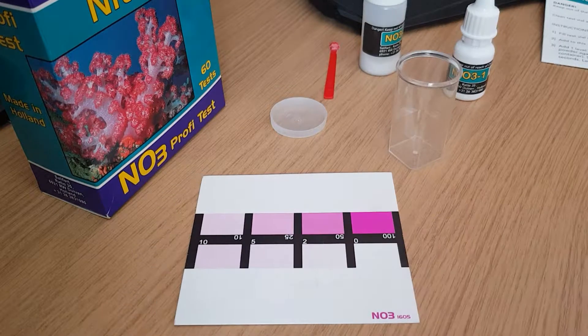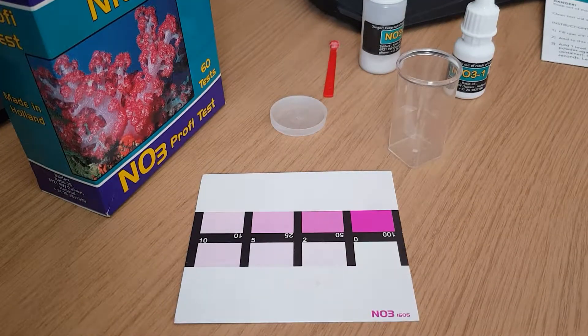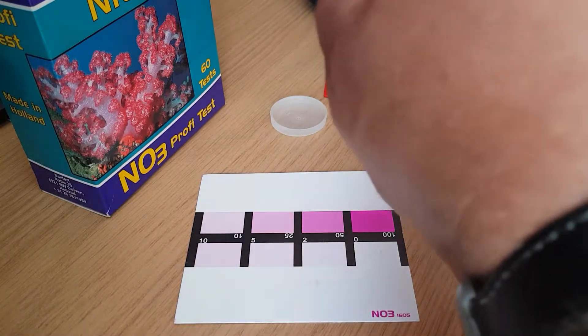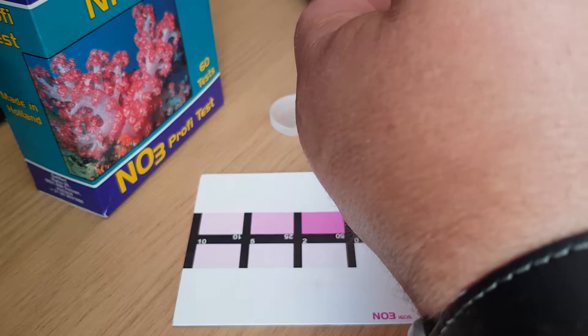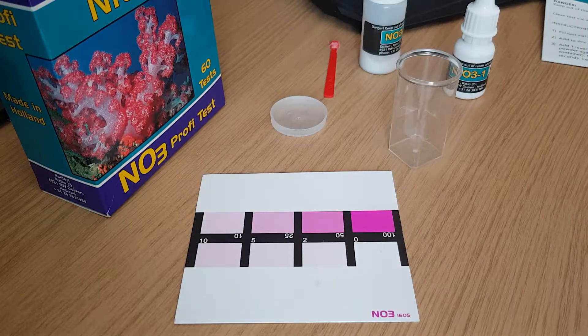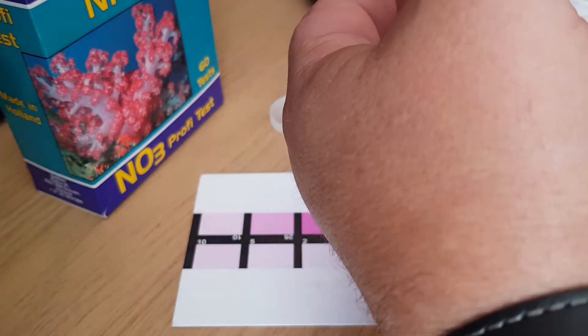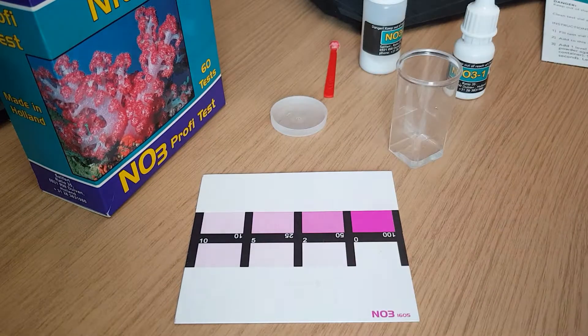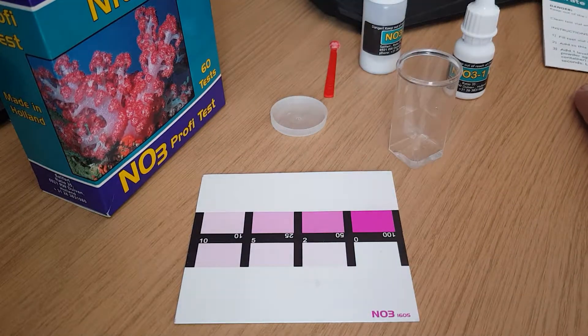I have both test kits so I'm now doing the Salifert to double check. Salifert stands for one mil of tank water, so take it down to one mil.